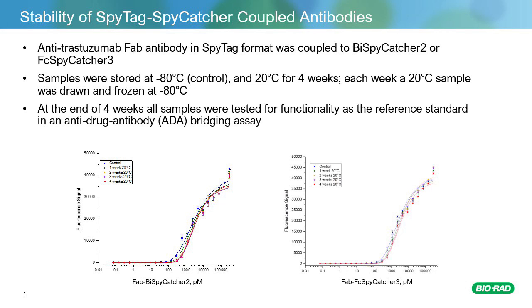So all of the Fabs would be capable of binding, whereas what we hypothesize is in the mammalian expressed version, some of the label was incorporated into lysines in the paratope, and so a subpopulation of that antibody will be unable to bind the antigen, which is why you get the reduced sensitivity.